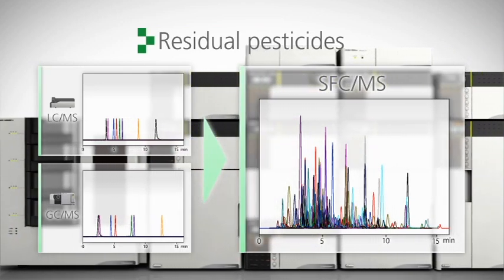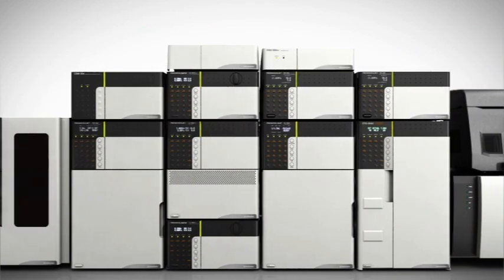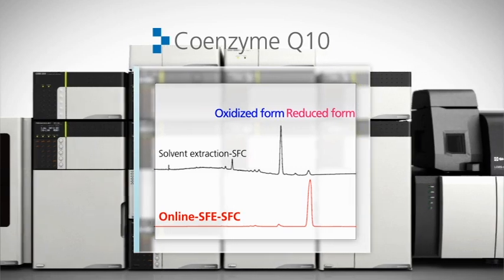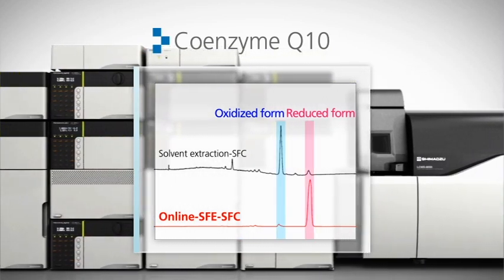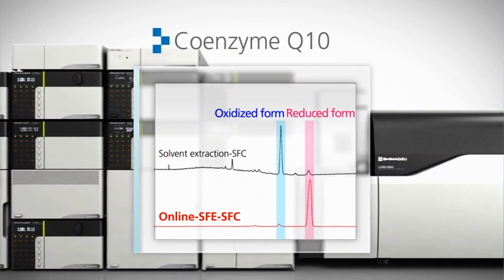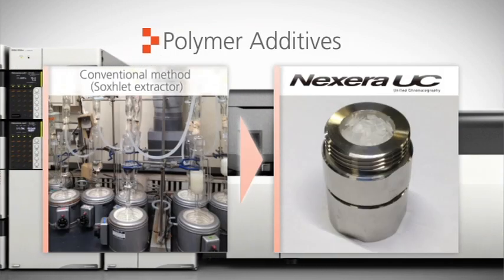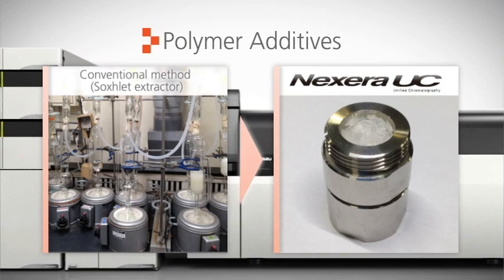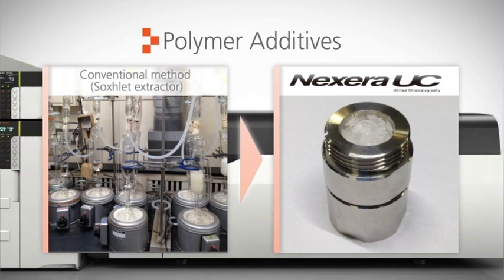Volatile and non-volatile pesticides are simultaneously analyzed, a process that previously required separate LC/MS and GC/MS analysis. Supercritical extraction of labile compounds like the reduced form of coenzyme Q10 prevents oxidation that occurs with common sample preparation techniques. Conventional methods using Soxhlet extraction for analyses of polymer additives can now be done by simply loading comminuted samples into the extraction vessel.